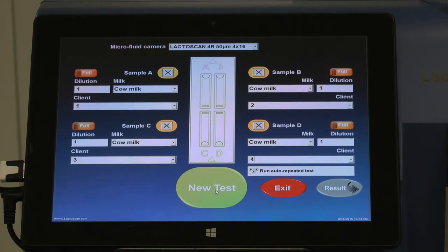Then enter the name of the supplier or choose from the drop-down menu. After entering all the information, press New Test to proceed with the analysis.